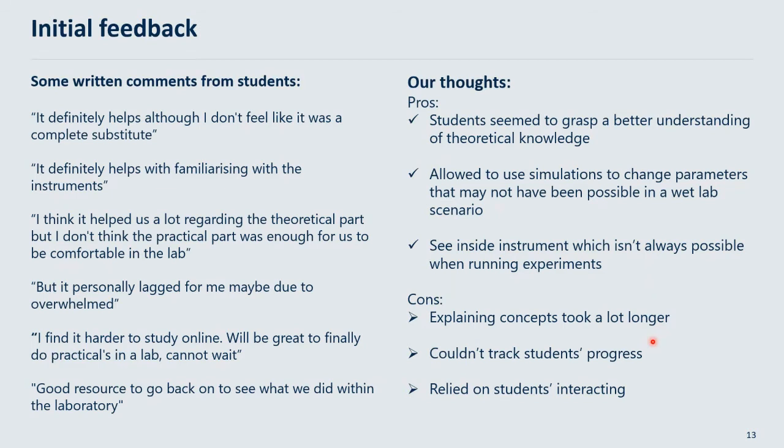And also in the virtual laboratory, which I thought was quite nice, we had 360 images of inside the equipment, and that's not always possible when we're actually using those instruments within the laboratory setting. So it gave the students a better understanding of what goes on inside of the instruments.